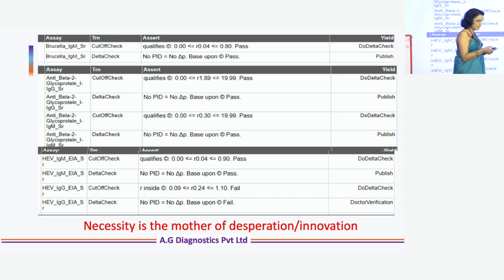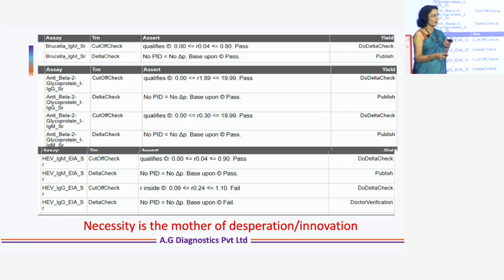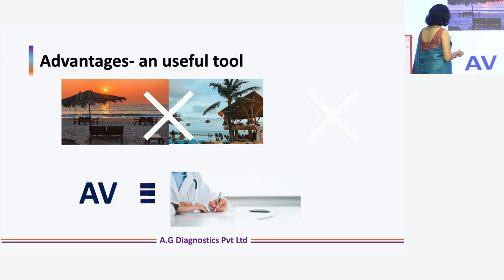Okay, so we decided why not try out for these kind of results also, serology, immunoassays, and we are experimenting with this. We are at the moment trying to play, obviously with great caution we are going, so our pass rates are not very high, but I have somewhere started the thinking and process that as many results that can go with auto verification, why not? Because it spares time for more important work, other work.